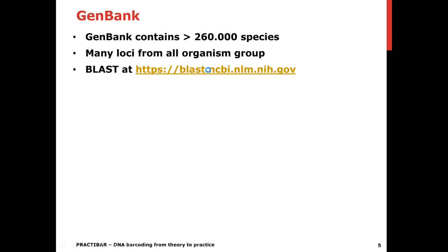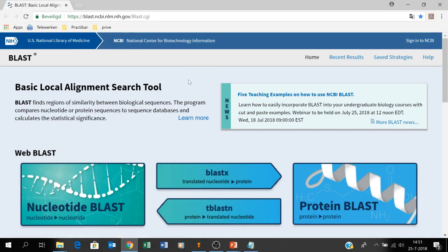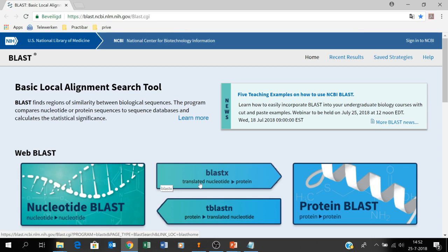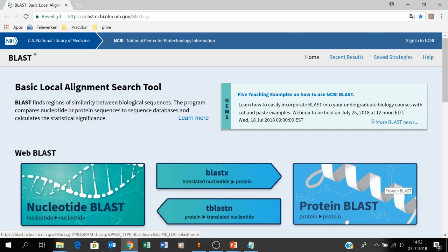We're going to this website and now we are at the NCBI BLAST website. You see here different BLAST options like Nucleotide BLAST, but you can also do a Protein BLAST — where you have your nucleotide sequence BLASTed against a protein database, or you have a protein BLASTed against a translated nucleotide database, or a protein BLASTed against a protein database, which is called BLAST-P.